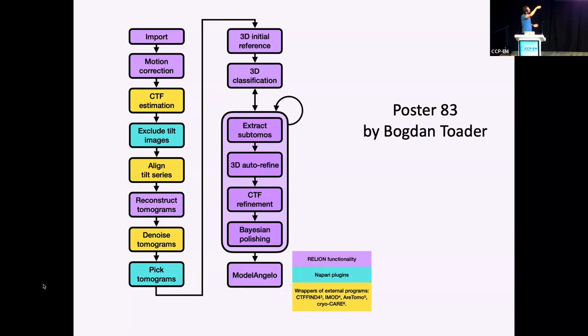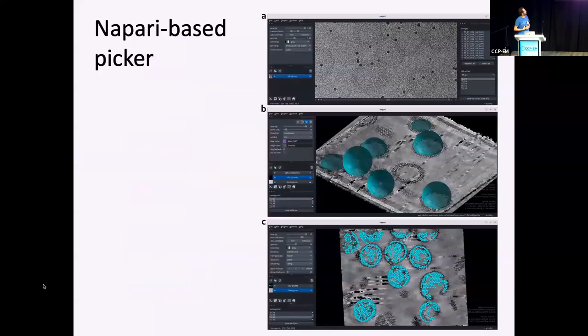And so the way into what used to be Relion 4 subtomogram averaging is a lot easier than it used to be, depending on all kinds of Python scripts to IMOD, and it depends which version, etc. All of that hopefully will be better now. Another change we made to this part is that Relion Refine can now work with 2D particle stacks rather than what we call 3D pseudo-subtomograms in Relion 4, which makes it about an order of magnitude faster and lighter on your disk. So you'll be happy to hear. These are just some screenshots from Alistair's beautiful viewers in Napari.